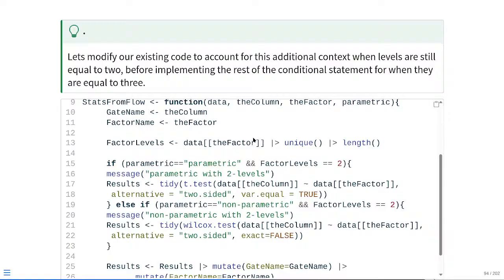So in this case, if we are running a numeric column that is parametric, and it is being compared as far as the group column, let's say infant sex, which is going to return back as true, both this part of the statement is true, and then this part of the statement is true. So overall, this is going to be returned as a value of true, and it's going to go ahead and proceed and run the code between the 2 curly brackets.